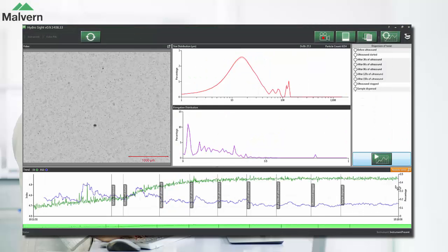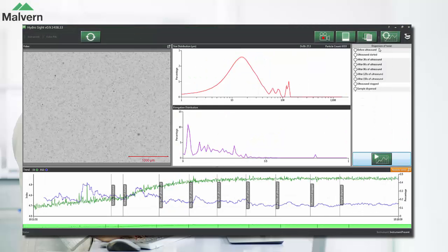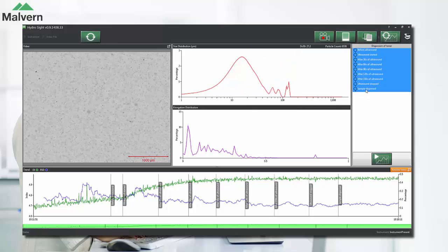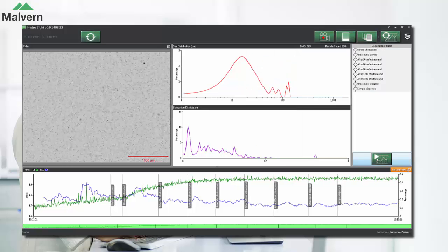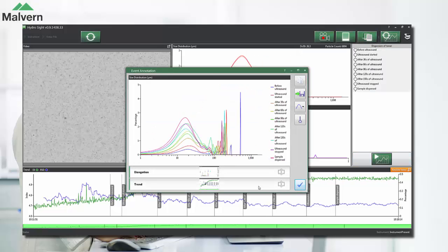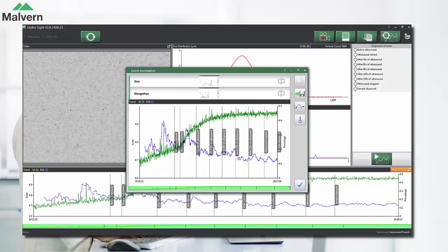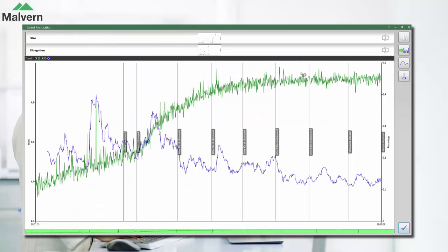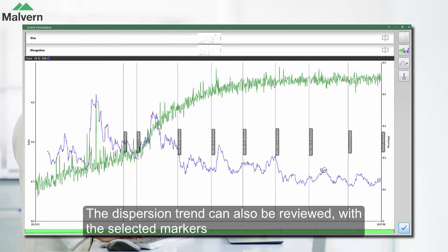If we select all of the events and review the dispersion trend, this shows how the dispersion index increased and the relative standard deviation decreased as the sample dispersed.